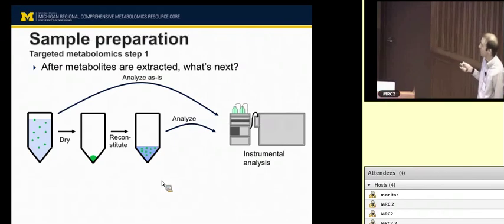Recursive processing. We found some features in some samples, but not all samples. Are we sure that the computer, which really did this feature detection for us, did a good job finding all of our features, or can it do better if we say, go back and look for things that you missed?